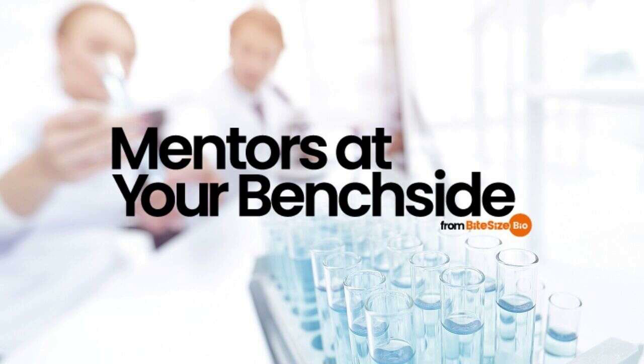Ionic bonding is the most important type of bonding in histological staining methods. It exploits electrostatic attraction between ions of opposite charge, one of which is fixed in the tissue and the second of which is in the dye. Hematoxylin and eosin do not color randomly. Instead, the dyes exploit differences in the chemistry of the tissue to differentially color various tissue components.